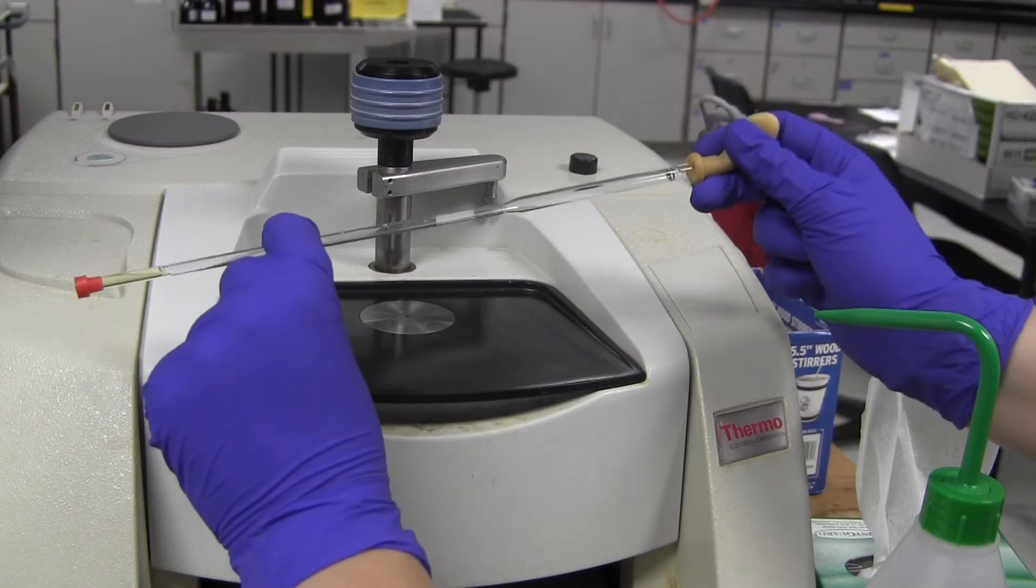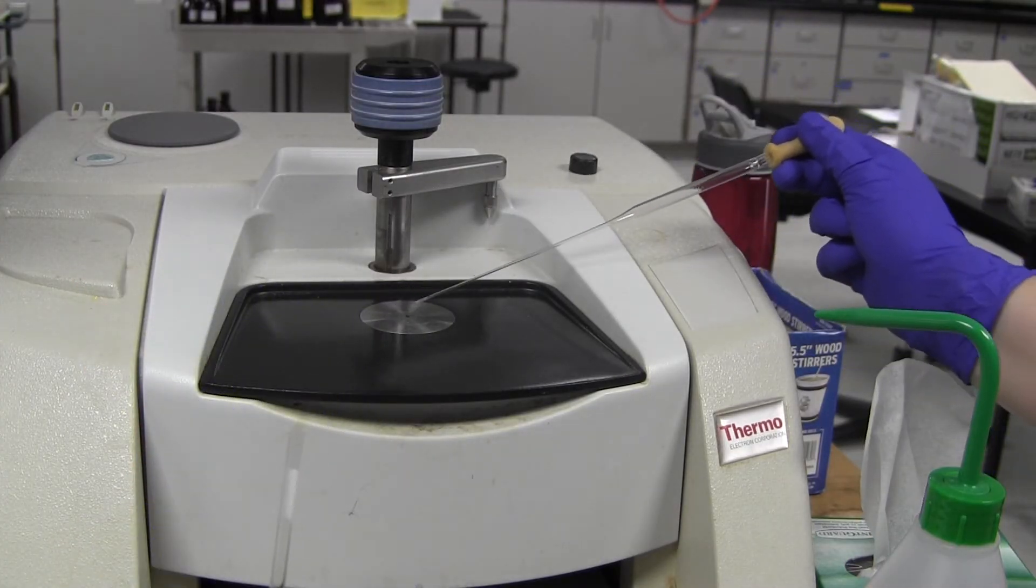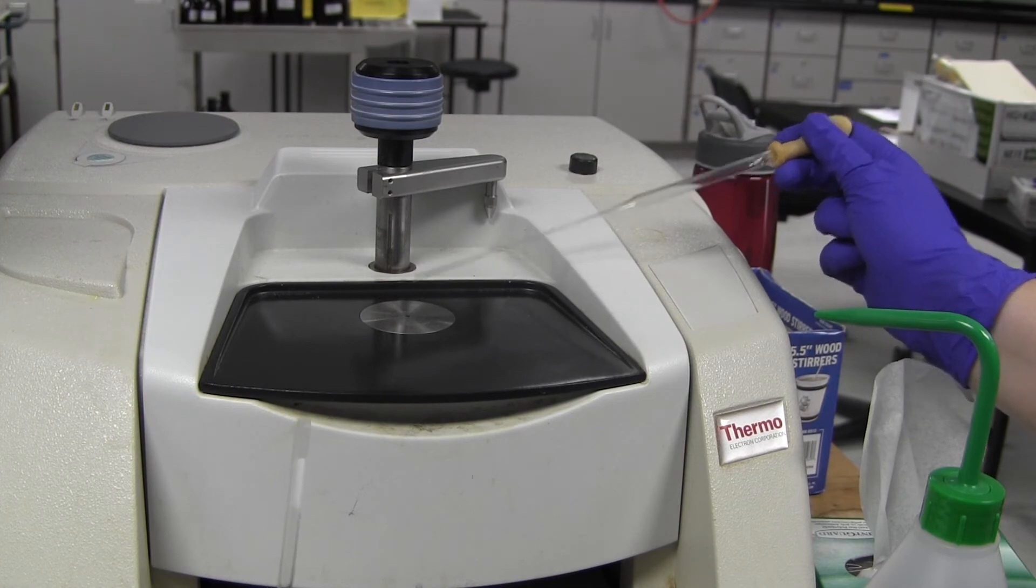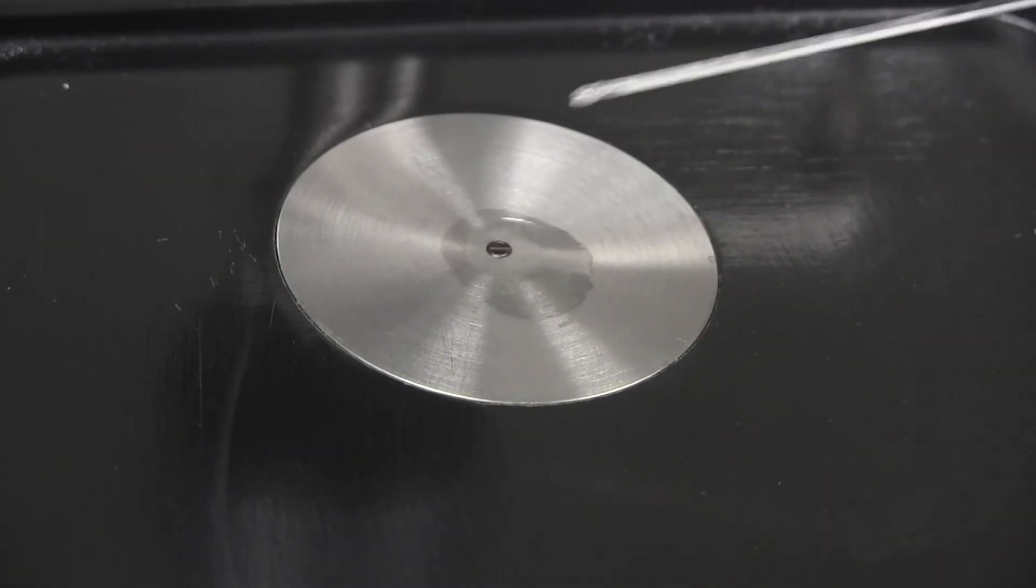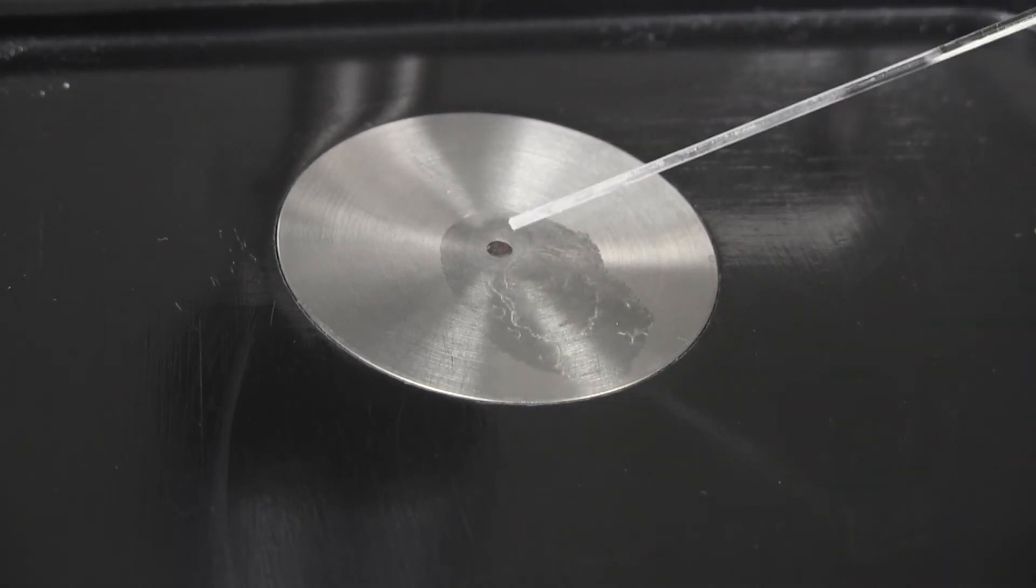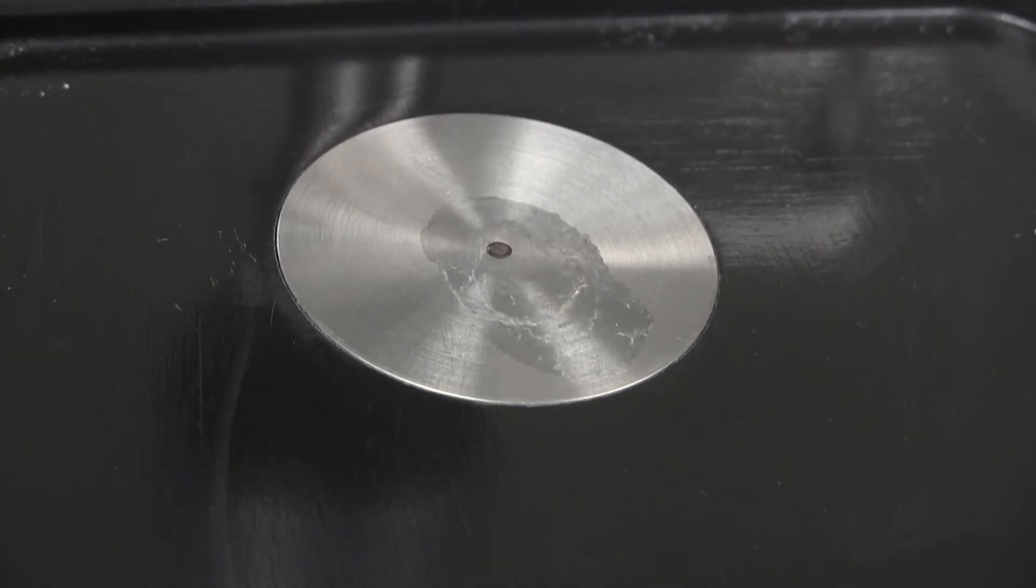Now you will load your sample. Make sure that your unknown is mixed in with the NMR solvent. Invert the tube once or twice. Then, with a glass pipette, put one or two drops from the NMR tube onto the IR crystal. Allow this liquid to evaporate and place one more drop on the crystal.